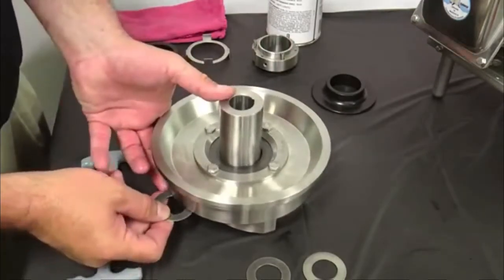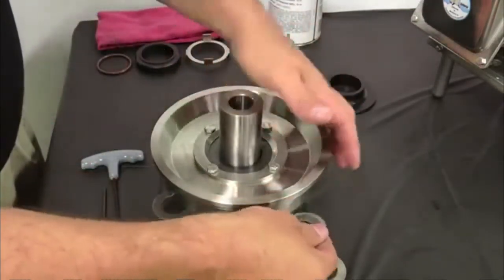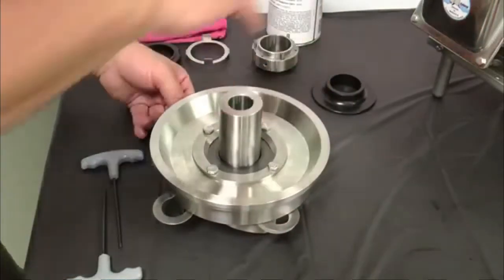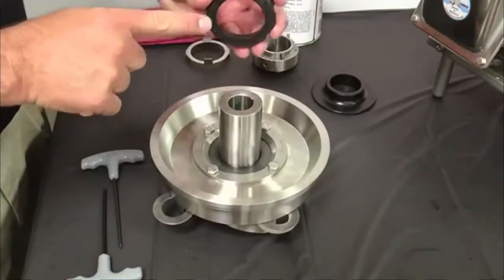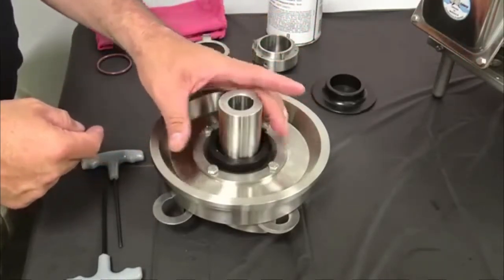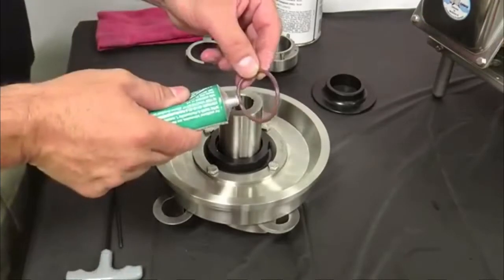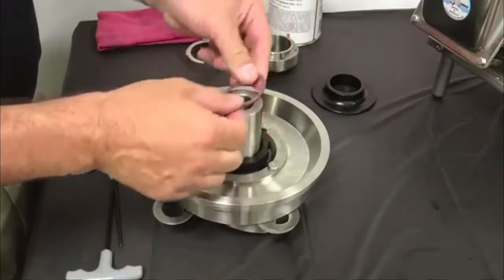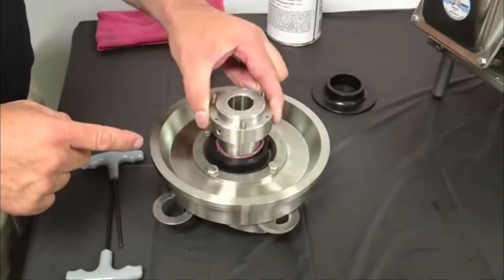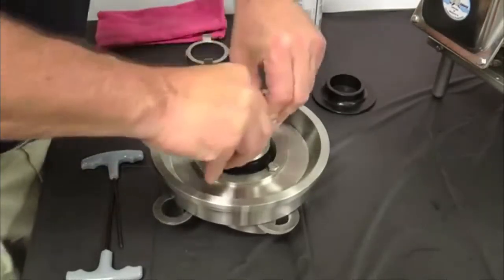Temporarily insert 30 thousandths inch spacer shims between the impeller blades and back plate to provide the necessary clearance. Place the rotary seal in position over the impeller shaft and down against the stationary seal. Lubricate and slide the seal O-ring onto the impeller shaft.